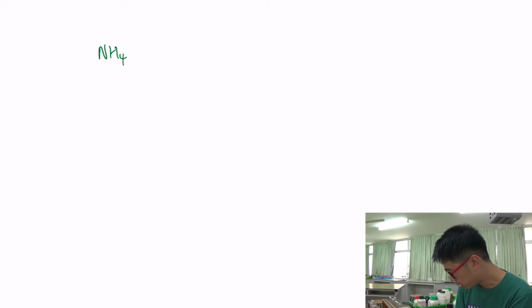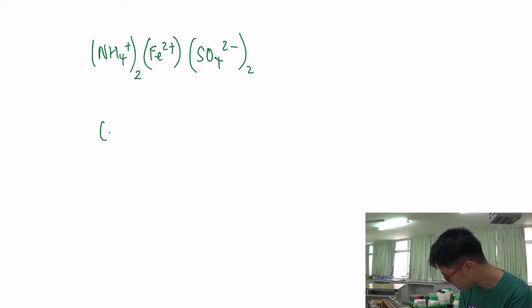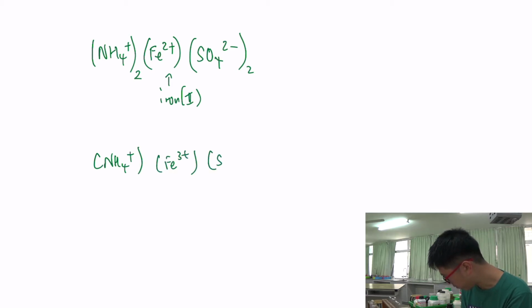We have talked about the NH4+, Fe2+, you need 2 of that, and the SO4 2-, you need 2 of that. That was the source of iron 2. I'll show you in the other tutorial videos. I'll probably use the same here so that I'm not wasting chemicals at all. As you know, chemicals are expensive, and that's why you need to cherish every single opportunity you get in the lab. So this is a +1 and a +3. So this is the -2, I need 2 of it.